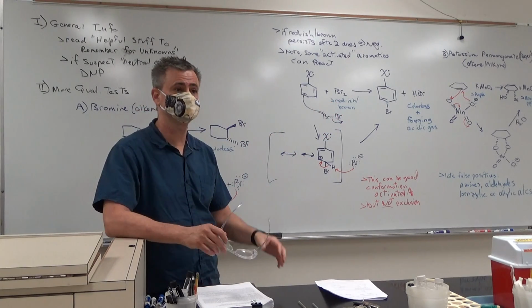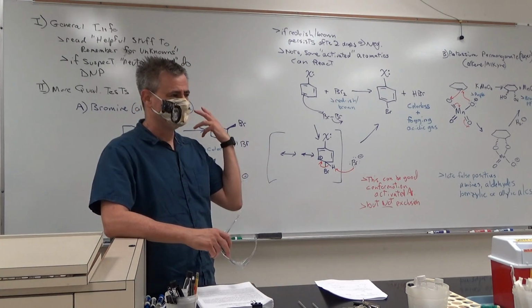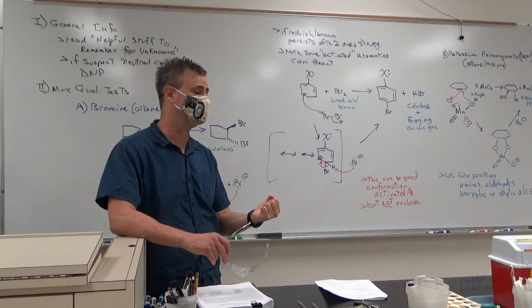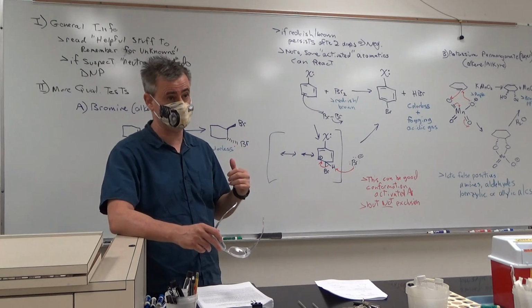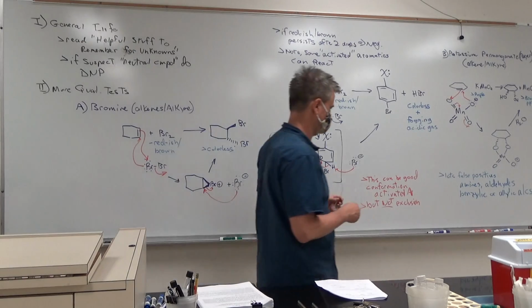That could be some evidence to suggest that you have an activated aromatic. Or conversely, if I got a positive bromine test, I don't know about the fogging business, gosh, am I sure it's an alkene, or could it still be an aromatic? Well, if you got a positive bromine test because it's an alkene, it'll definitely react with this one. Okay? All right.